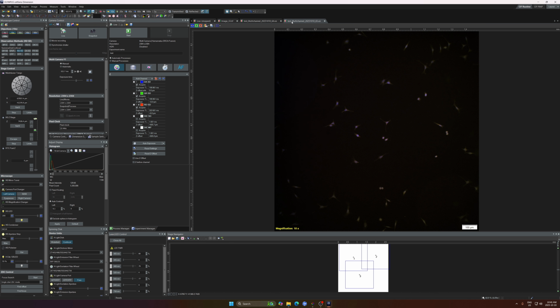What you notice here is called test multi-channel. That's basically your base file name. You can type anything you like, and that will be the prefix string. Later it automatically attaches the date and what kind of image it is, multi-channel, and 2025 October 10 and number 65. And then it will be a special file format. We can talk about that later.